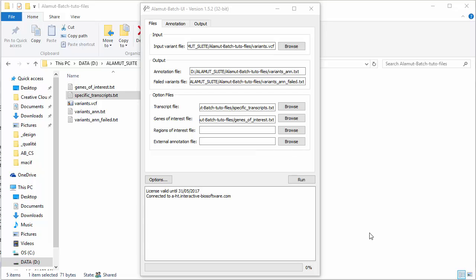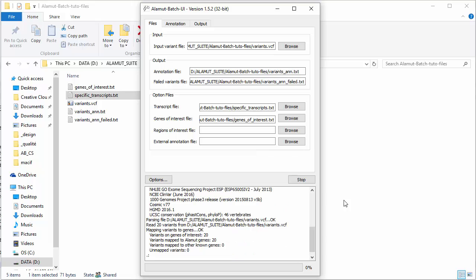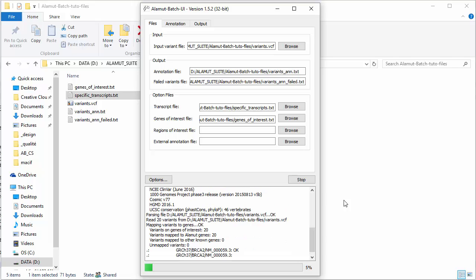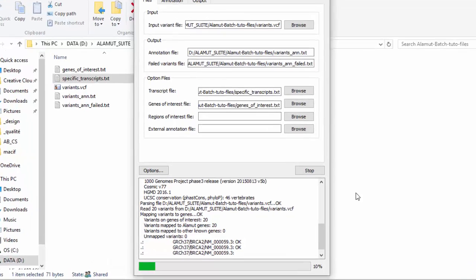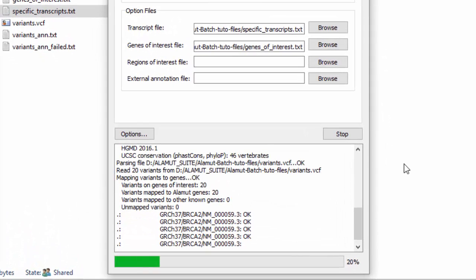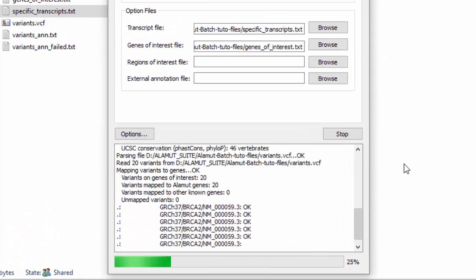Click on Run to launch the analysis. Alamut Batch will let you know when the annotation process is complete. Here, you can visualize at any time the progress of the analysis process.